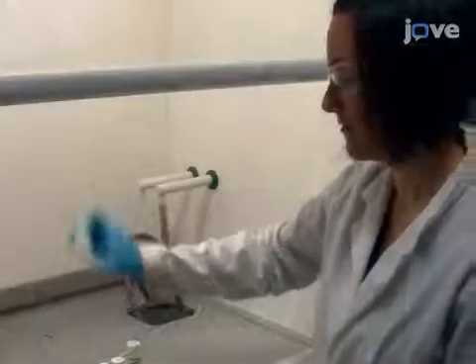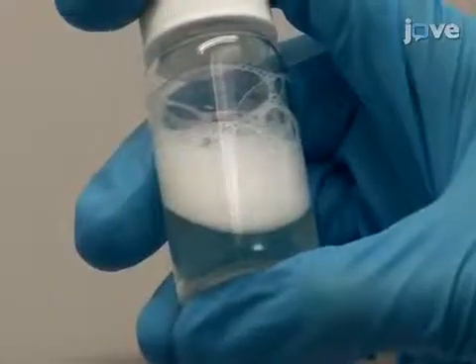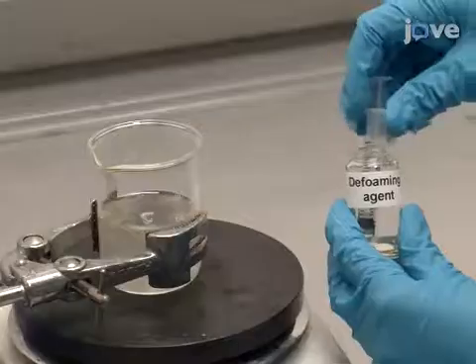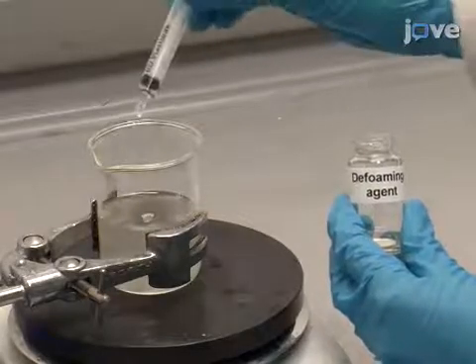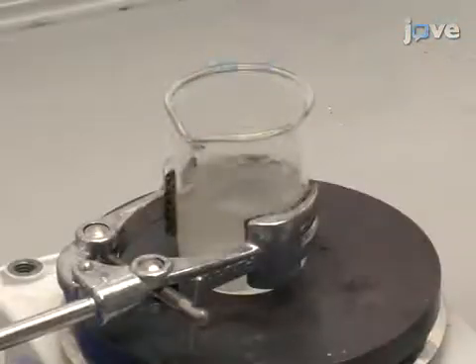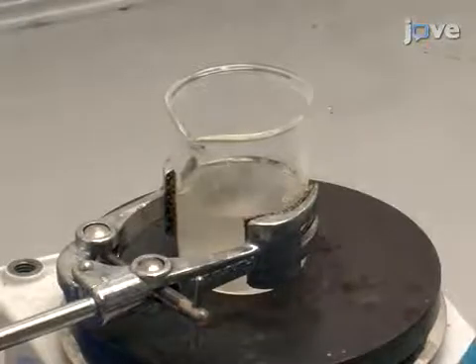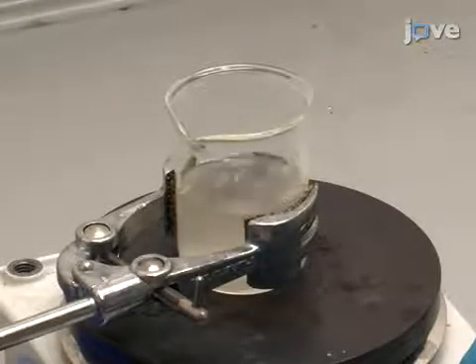Subsequently, test the ink by hand-shaking an aliquot in a closed container for 60 seconds. If any foam is observed, add another 0.5 grams of the defoaming agent to the ink. After the shake test, stir the ink solution for 8 hours at room temperature with a magnetic stirrer to ensure homogeneity.